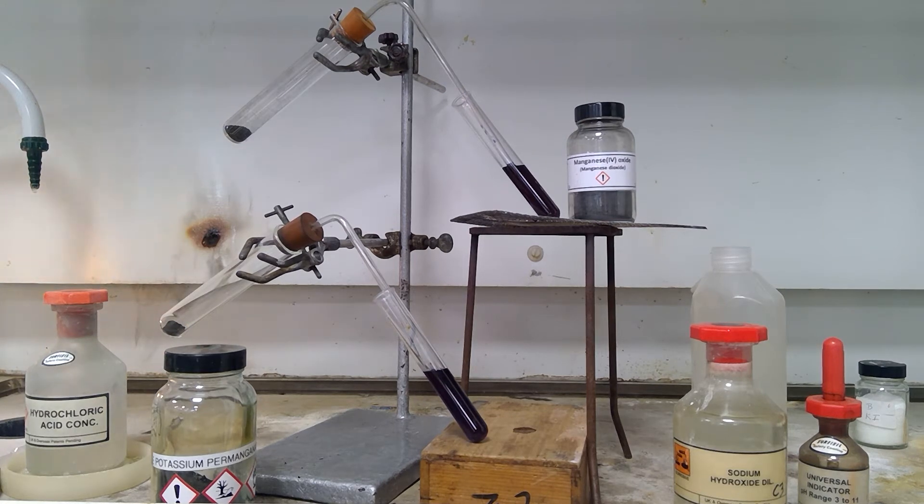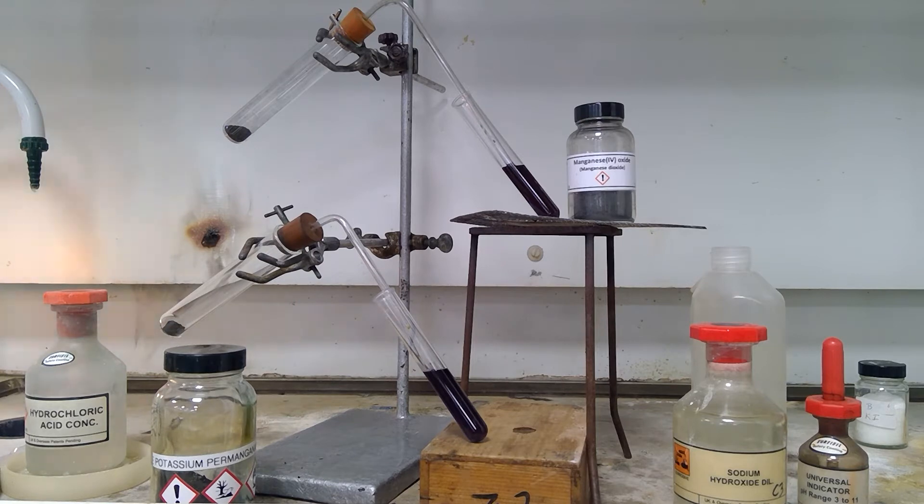This experiment links to the group 7 practical, the halogens, which is frequently done at Rugby School. It is experiment 1 where we compare the reactivity of potassium manganate 7, potassium permanganate, and manganese 4 oxide in their ability to oxidize the chloride ion in concentrated hydrochloric acid to make the gas chlorine. So these are potential methods of preparing chlorine.